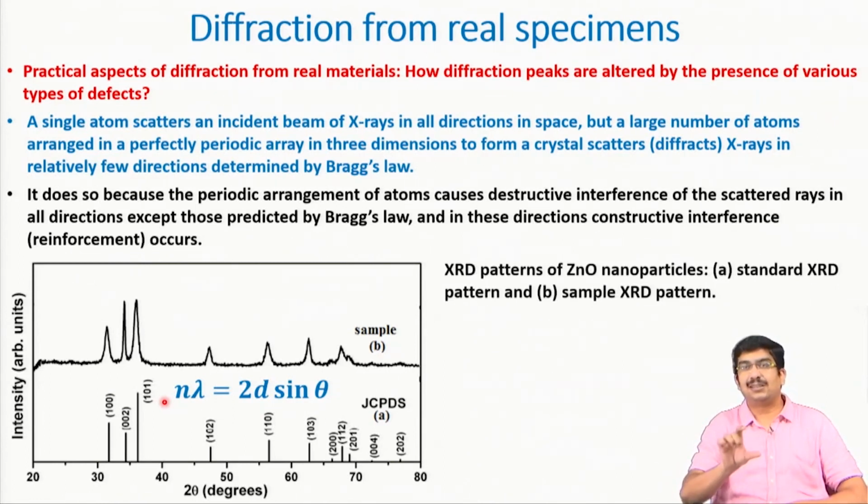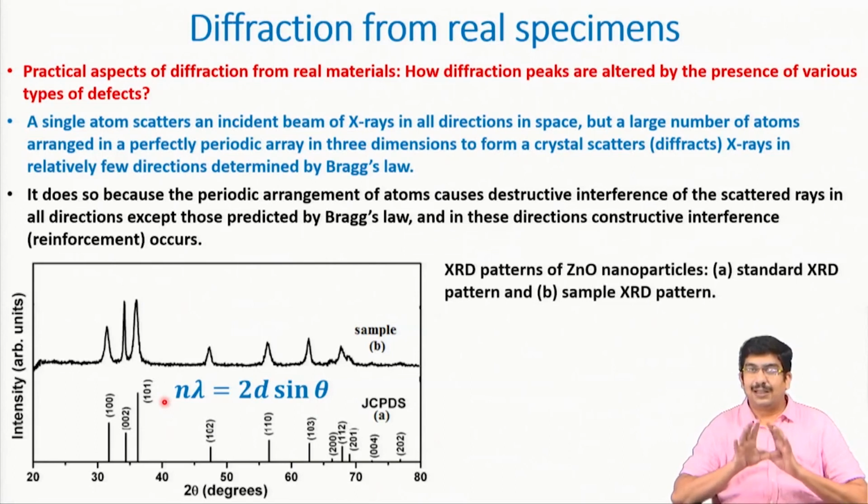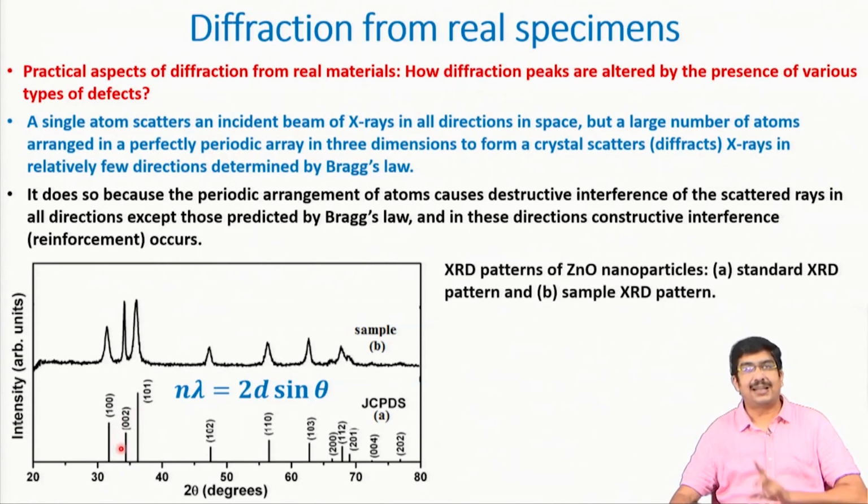In most of the other directions there is an imperfect or partial interference that is happening. So, that means only in an ideal condition is Bragg's law valid, and there only we are getting intensity along certain directions, and that Bragg's law has to be valid is related to the periodicity of the crystal itself in the first place.